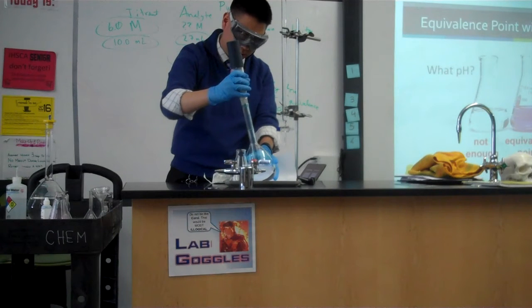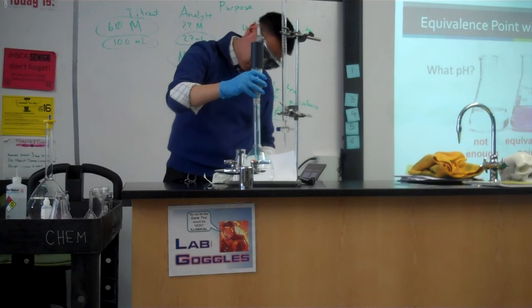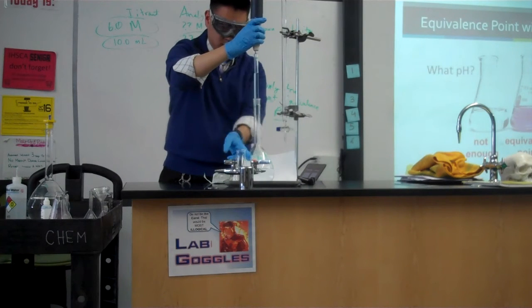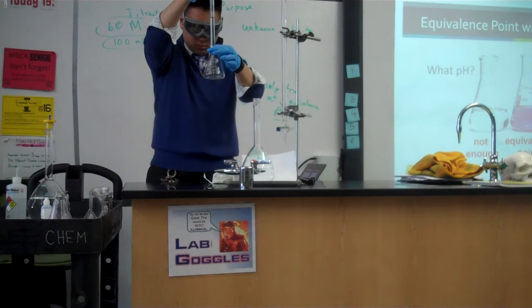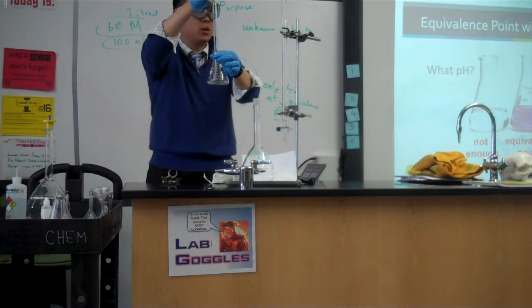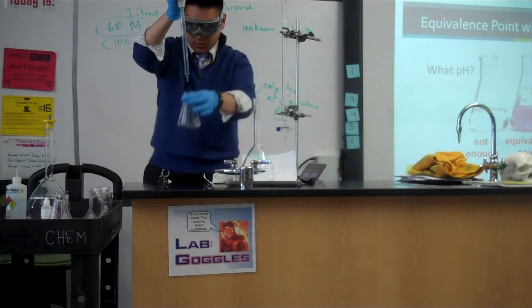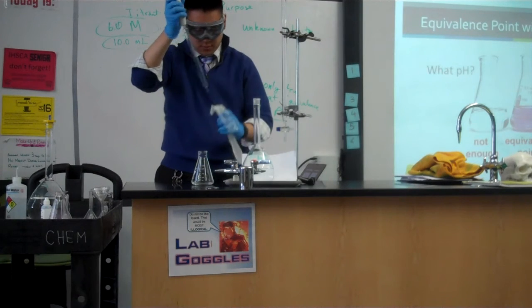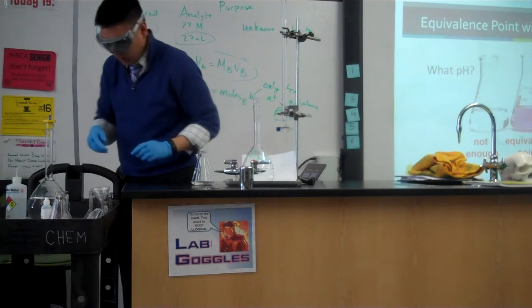There are tick marks on the side. And I can transfer this into my flask. This makes it nice and easy. And then again, just like our pipette bulb, there's an extra air release which we can use to push out the extra drop. Alright. We're done with this.